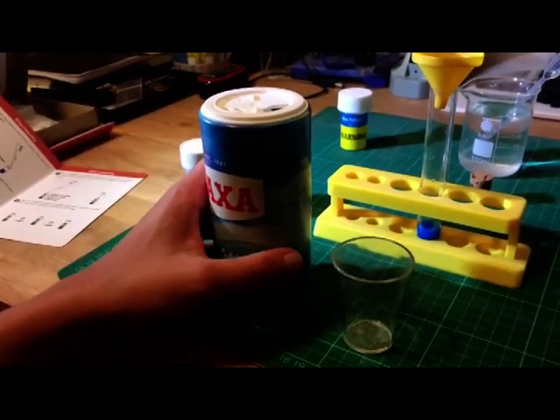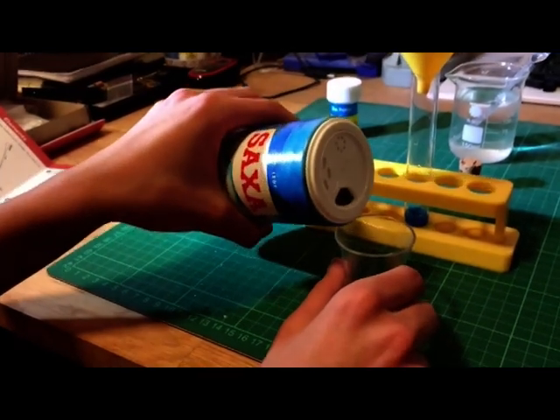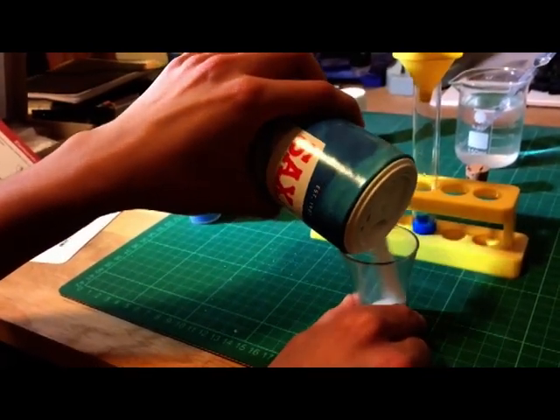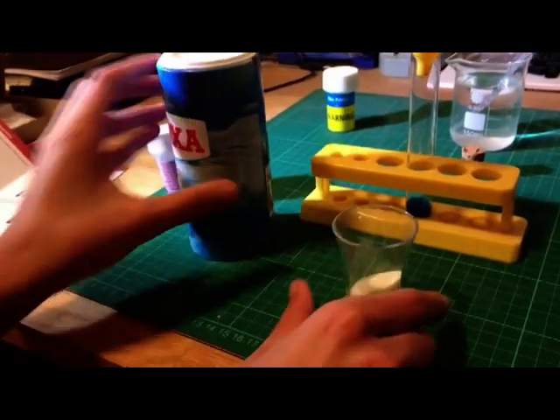Next, you need to add 3 or 4 tablespoons of salt into the test tube so that it forms a separate layer on top of the copper sulfate.